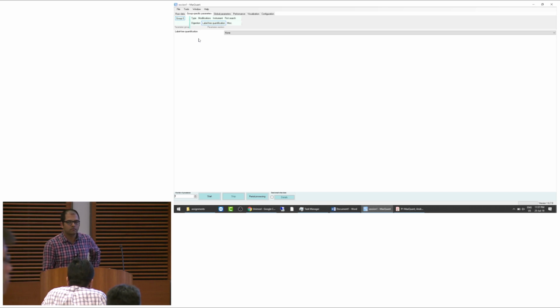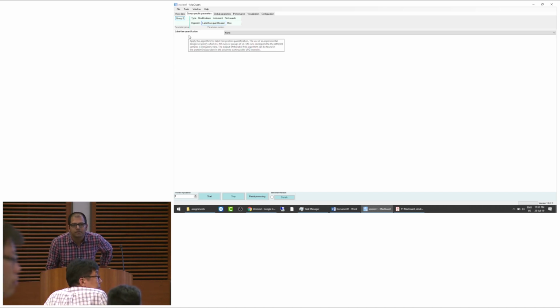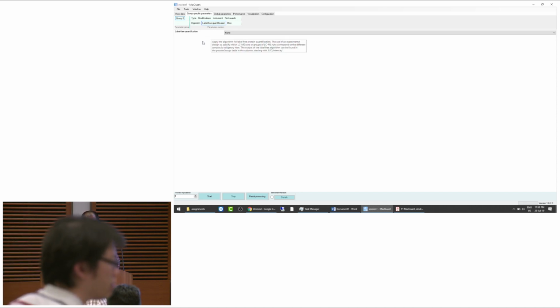Couldn't you just take the pass-through of the phosphocapture resin? Could you just save the pass-through in the phosphocapture resin and use that as your proteome file for each time point? You could. It's not perfect, but you could, yeah.